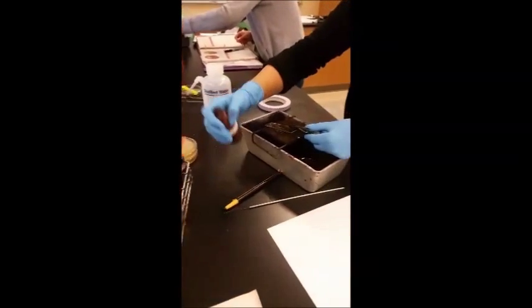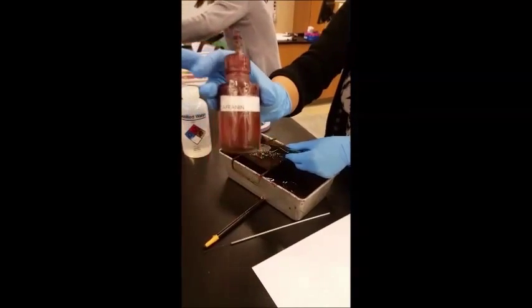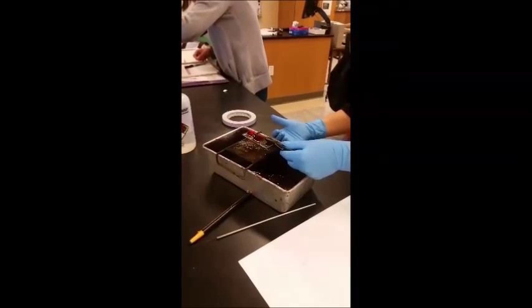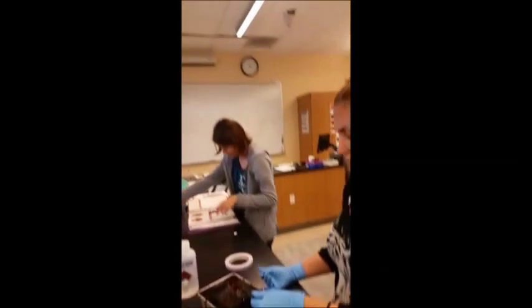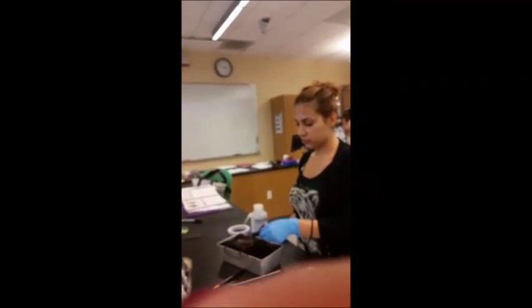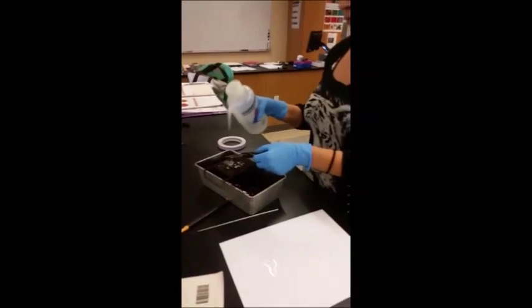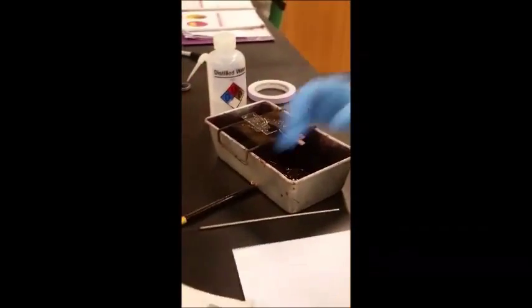And then we add the last dye, which is called safranin. This is the same amount as the other dyes, just a few drops on the slide. And then we let it sit again for 1 minute. After 1 minute, we will rinse the slide. This time we want to make sure there is no more dye left on the slide. We will wash it clearly.